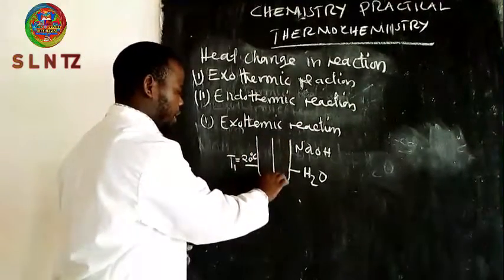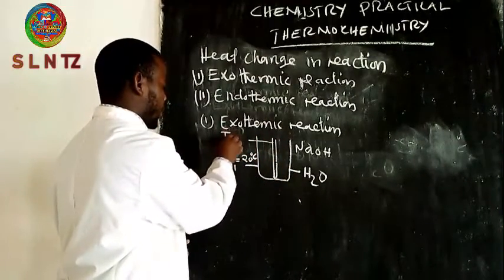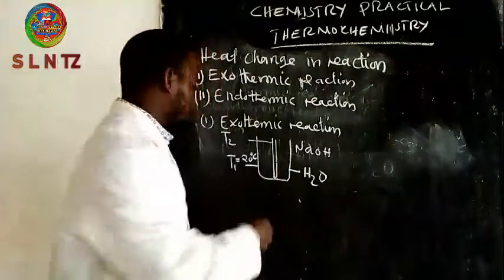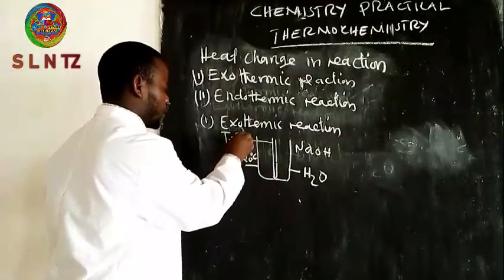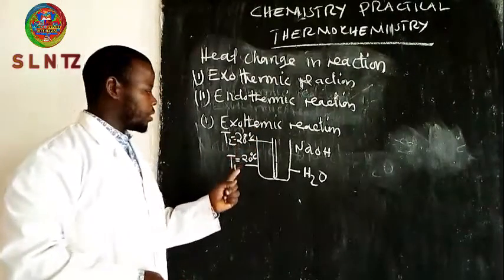There is a thermometer here. And the final temperature is, let's say, 28.